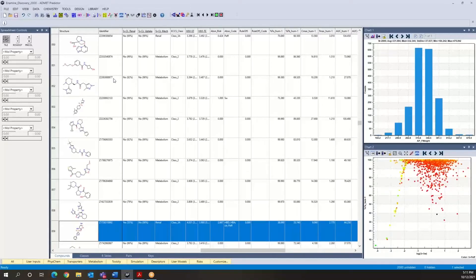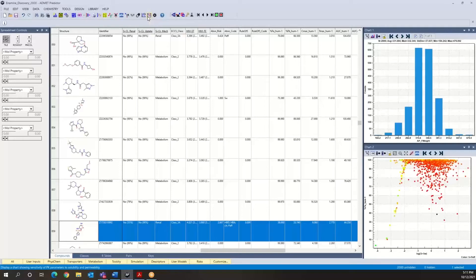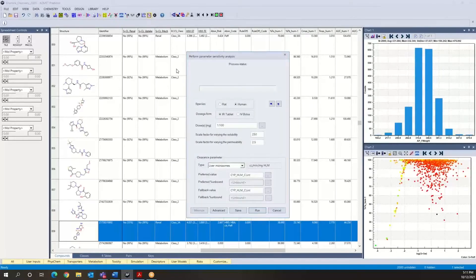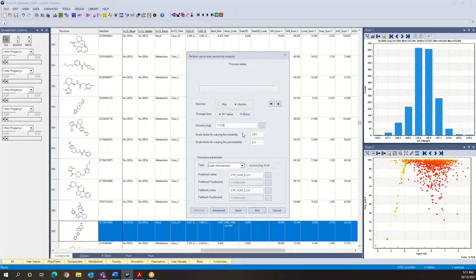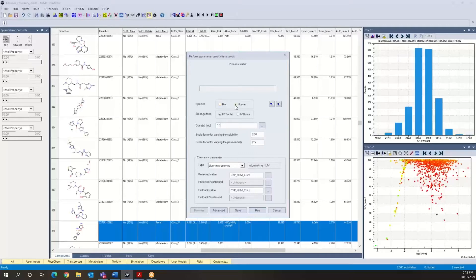And now going to our parameter sensitivity analysis icon here, open the corresponding setup dialog. We don't necessarily need to do this for two doses. We can just take a 10 milligram dose to look at this. Of course, we want to select the same physiology, human, that we had before and also the same dosage form being an immediate release tablet.